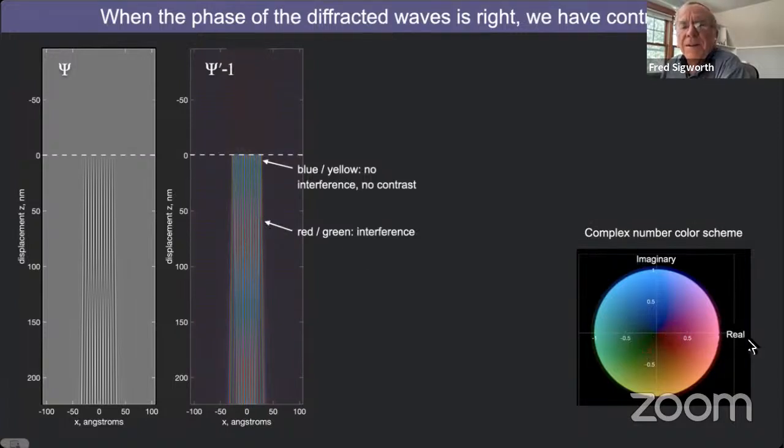That's what I want. It has a real amplitude, and we get interference at that point. And the interference gives us then a variation in the intensity. Okay, is that cool? Somebody raise your hand and say that's cool.